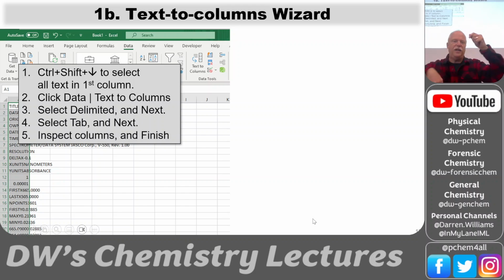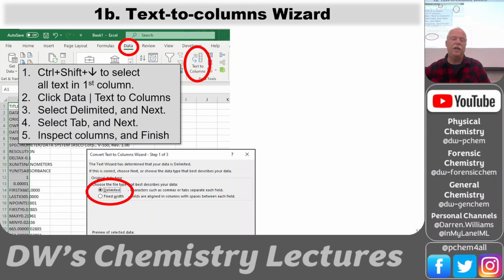So we can Control-Shift down to select the whole column. We go to the data ribbon, and there's the text to columns button. So we click text to columns, and we get this. And we have different ways of splitting that column. It could be a fixed width, which would be great. Sometimes the data is given to you where it's already in columns, but it's still just text, and Excel doesn't know where to cut the columns, and so you have to tell it. With a fixed width, you get to move the widths of those columns around until it gets the data that you want in each column.